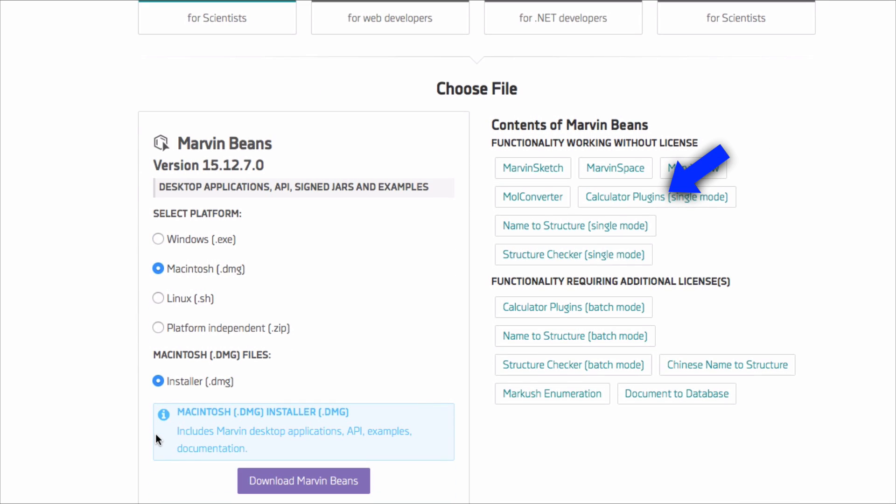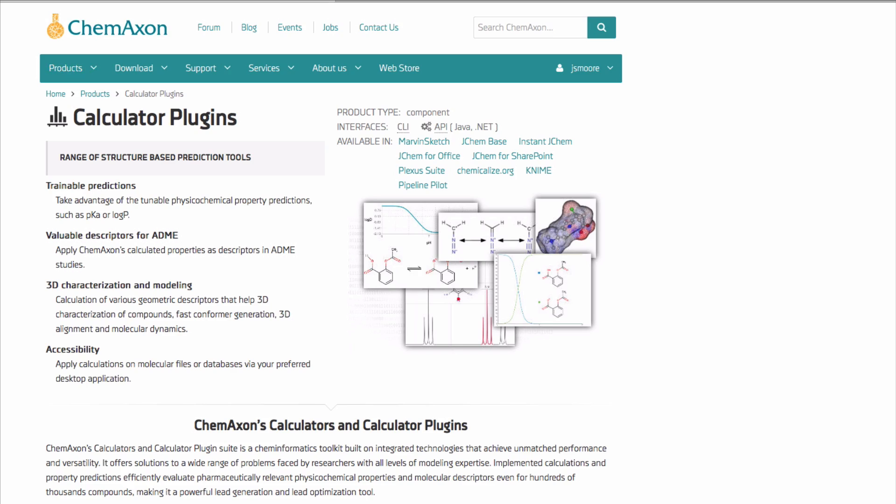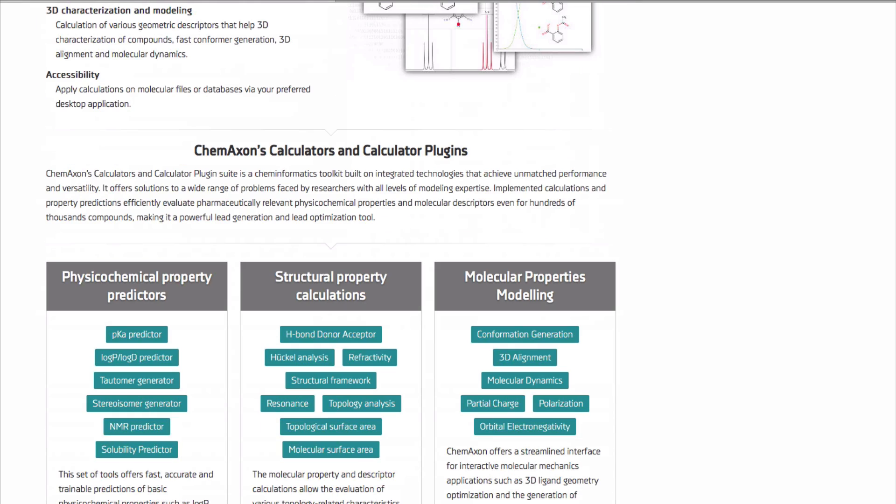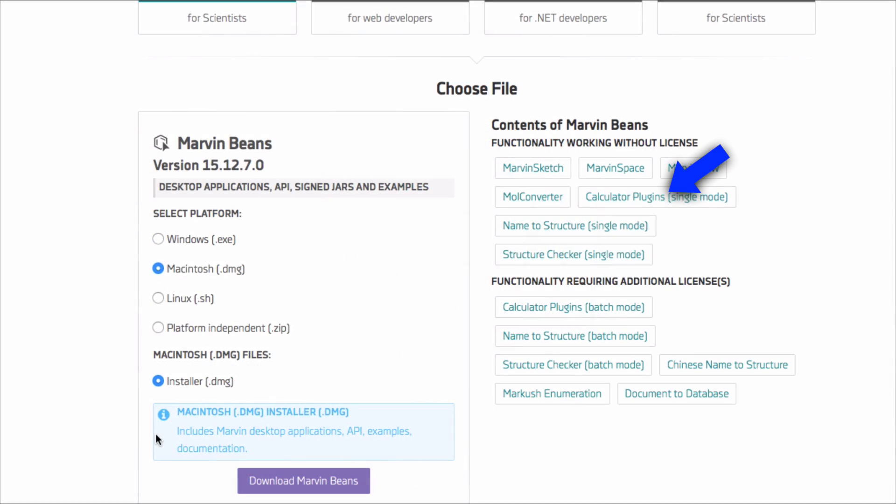By the way, Marvin's calculator plugins are great learning tools. Later in this video I will demonstrate how to obtain an academic license to access their full power.